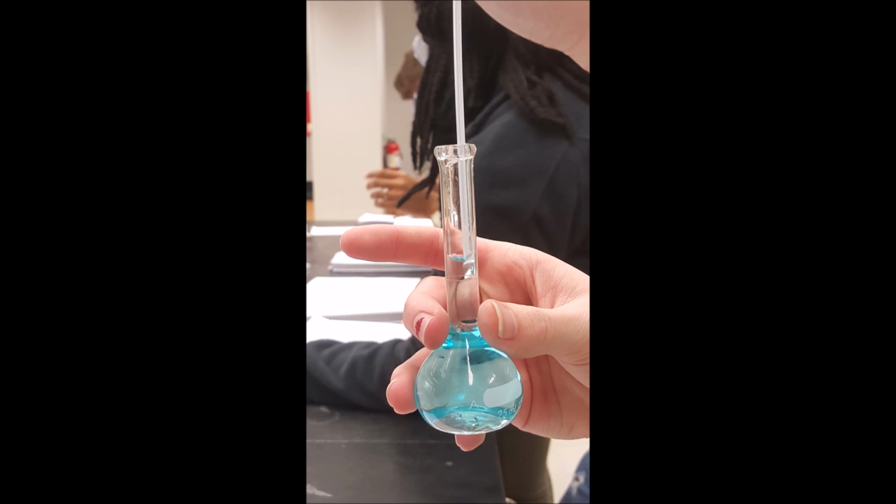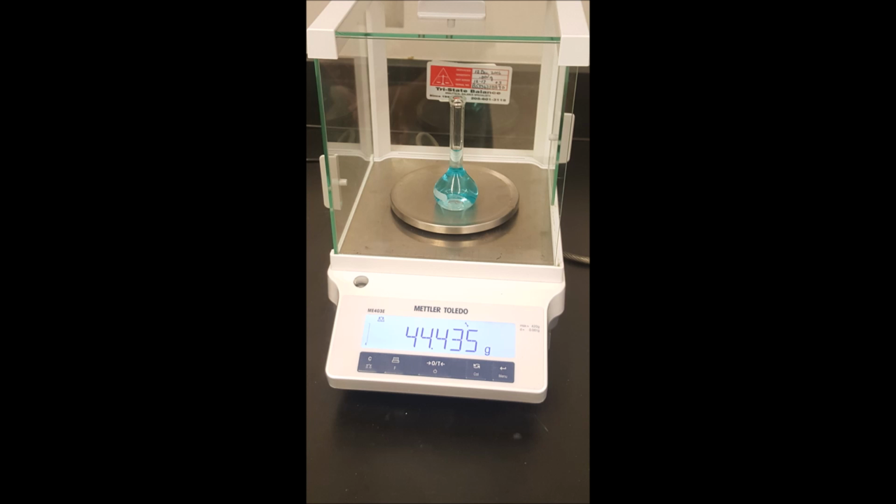Once you've gotten the exact measurement of dilution, you're going to weigh it. Whenever you weigh it, take the number that's on the scale and subtract the weight of an empty volumetric flask, which you'll get at the beginning of lab, to get the volume for your dilution.